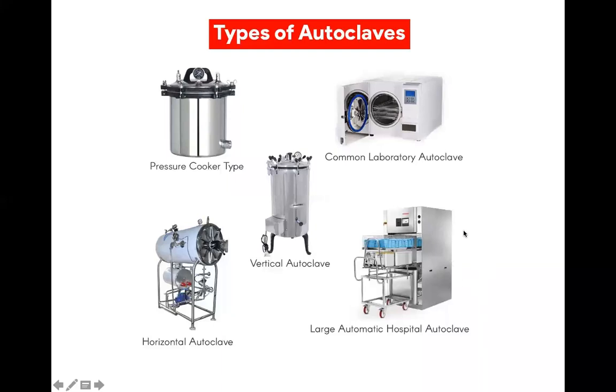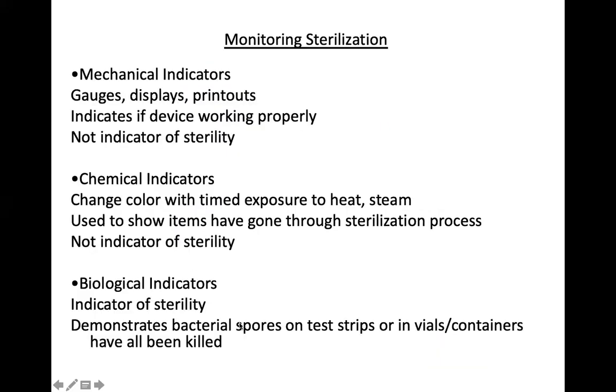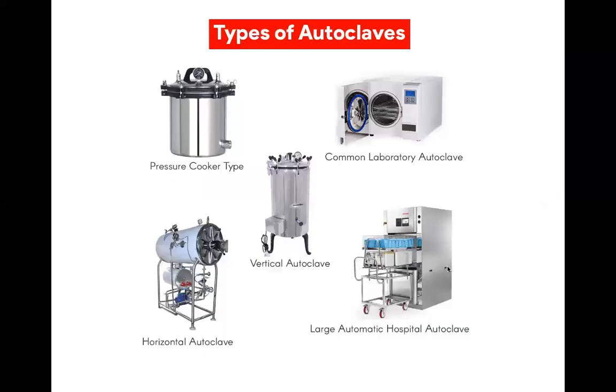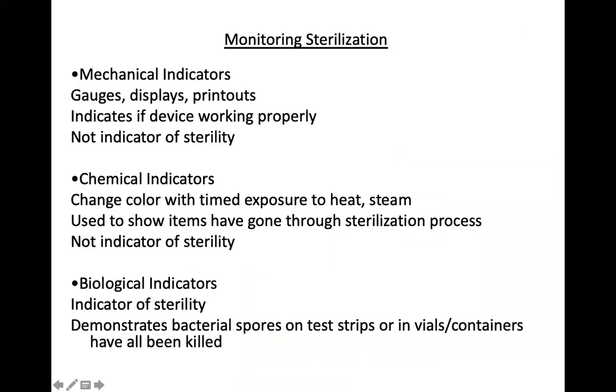Now, before you get those items, the door on the other side will not open if this biological indicator test has not been passed. So any process that you are doing, you will need to include the biological indicator in it. Then that biological indicator is obtained and we see if you have killed all microorganisms by failure to observe any germination taking place. And once you have ascertained that, then you can remove those items.